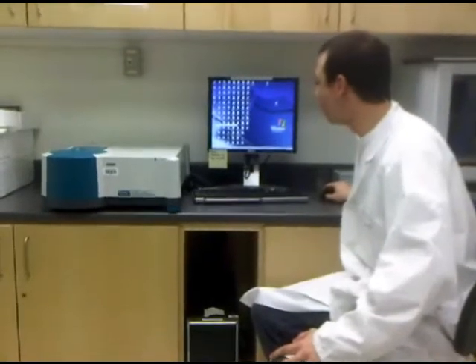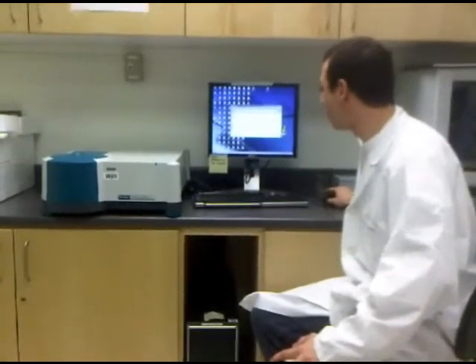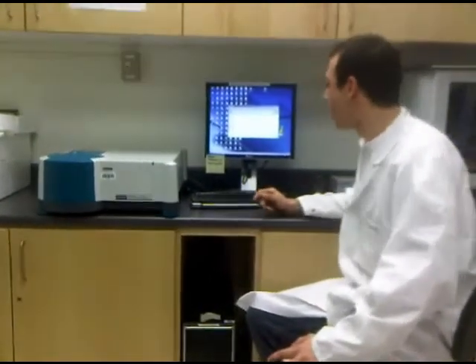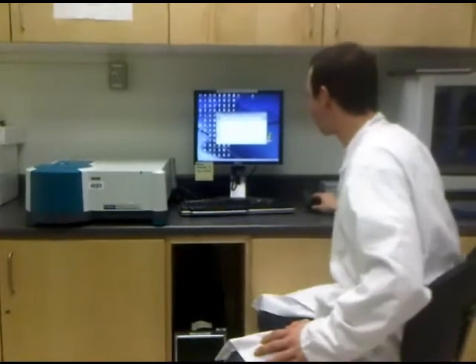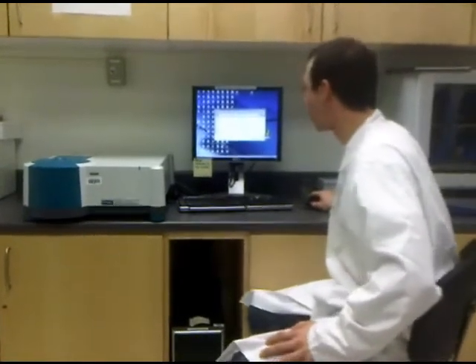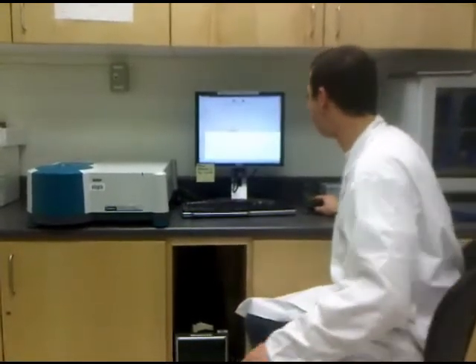You're going to come here and open the Carrywind UV folder. And if your lab tells you that you have to do a scanning kinetic first to find out what wavelength your solution absorbs at, you're going to want to run a scanning kinetic, so you're going to come here and open that program.